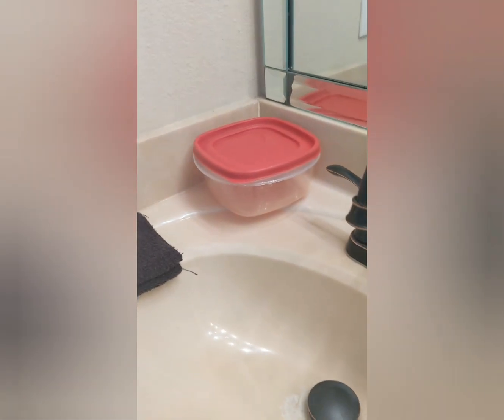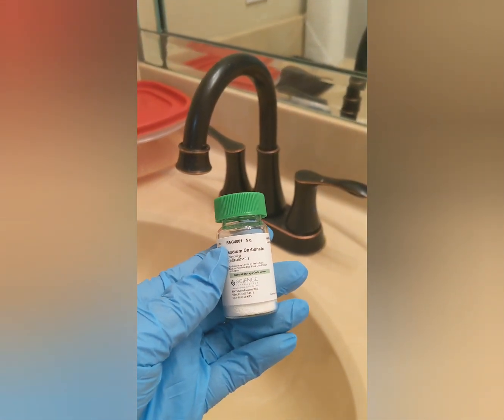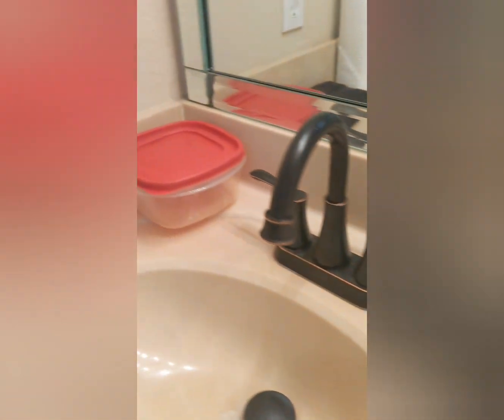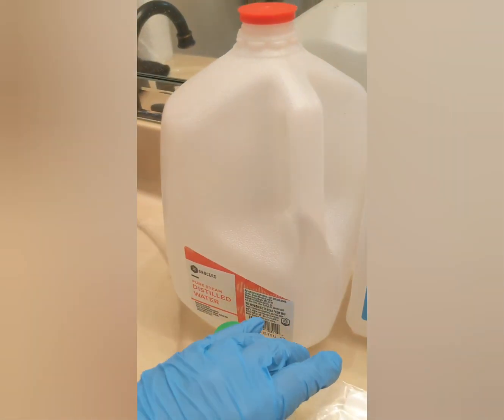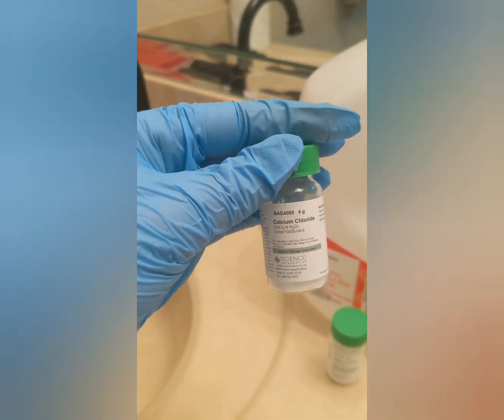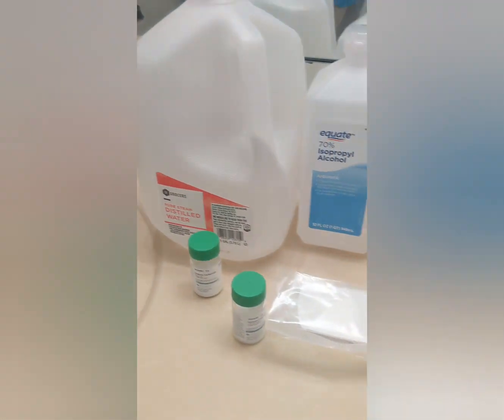Now, there's no ecological significance to sodium carbonate. However, the SDS sheet does state that if there is a spillage, it should be put in a sealed container pending waste disposal evaluation. And I do have the spill container here. For calcium chloride, the SDS states that it should not go into the wastewater system. So pending any spill with the calcium chloride, it will be gathered up and put either in this container or in a separate bag in order to be put into disposal.